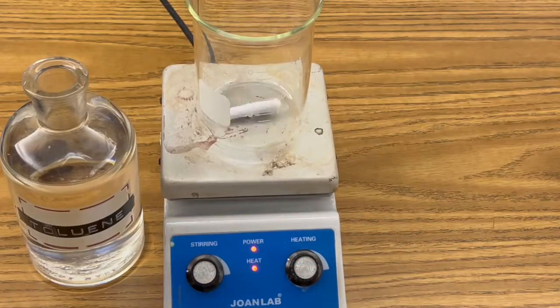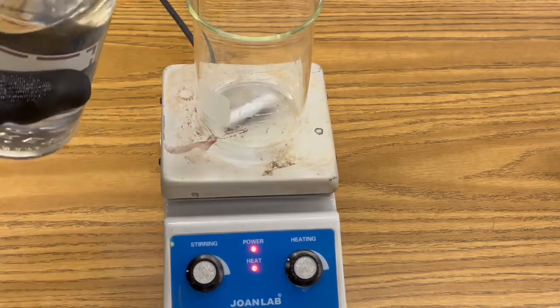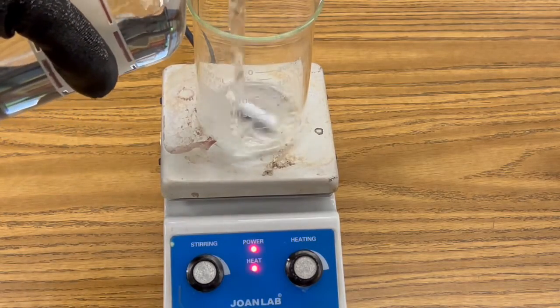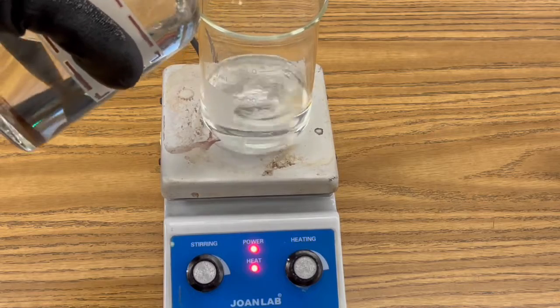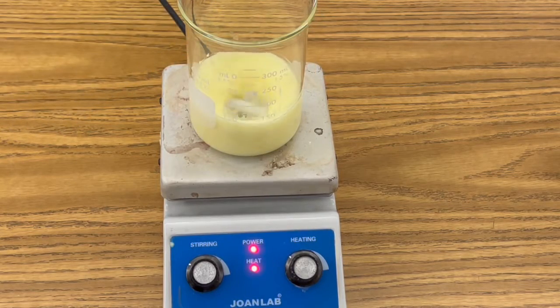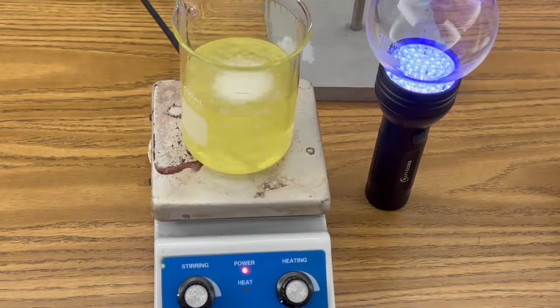The next step is to add 100 milliliters of toluene to my beaker and slowly heat it. Next, you can add your sulfur to your toluene. At 100 degrees centigrade, toluene can dissolve sulfur. Okay, at this point, all of our sulfur crystals have been dissolved in our toluene.